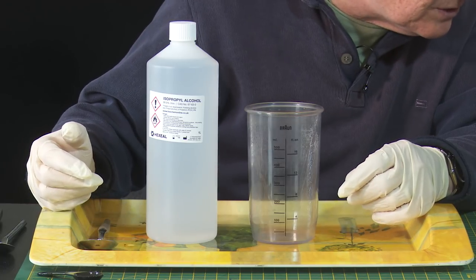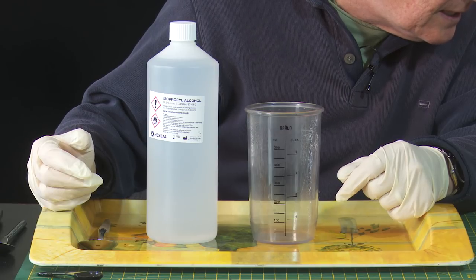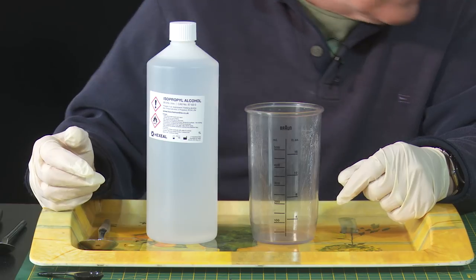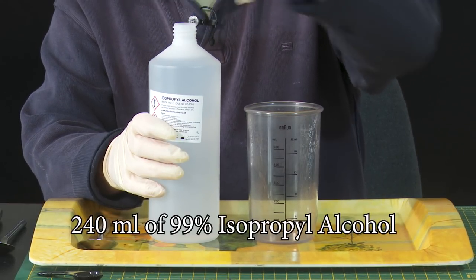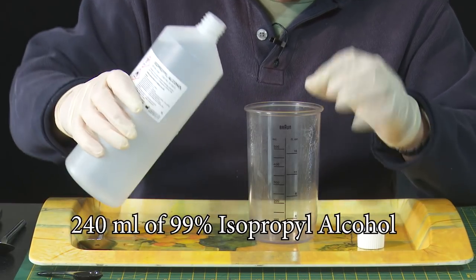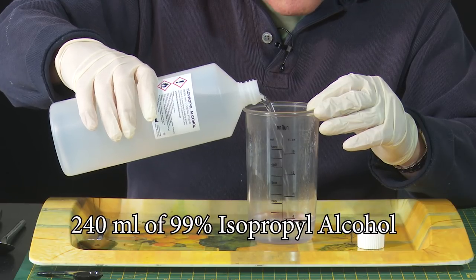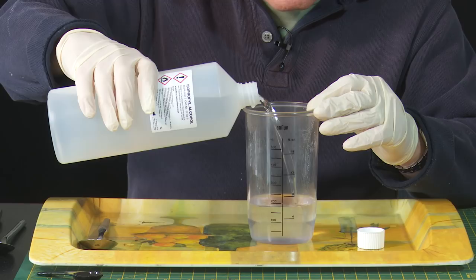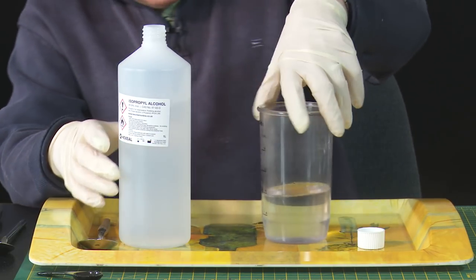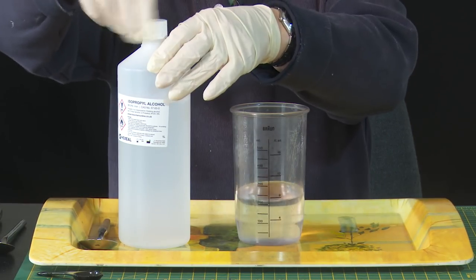I'm going to make up a total quantity of 320 millilitres of product in metric. The first thing I need is 240 millilitres of isopropyl alcohol, so just pouring that in — 240 millilitres. Then put the top back on.